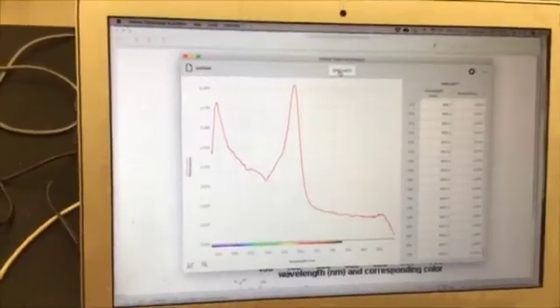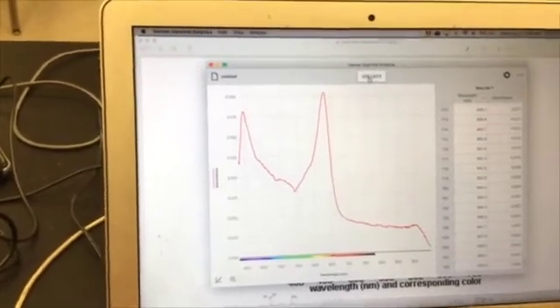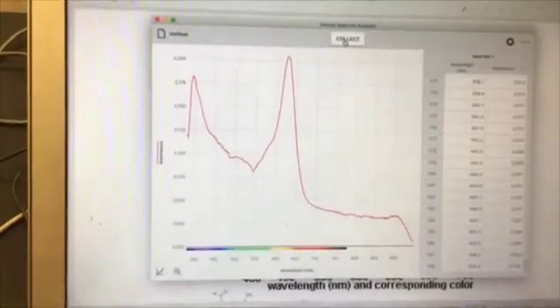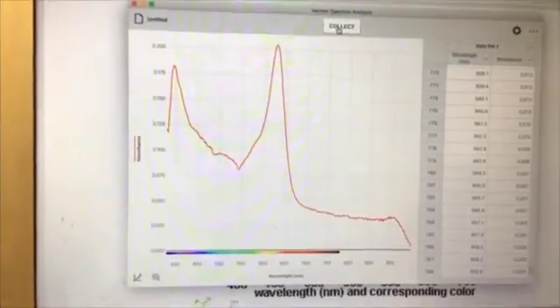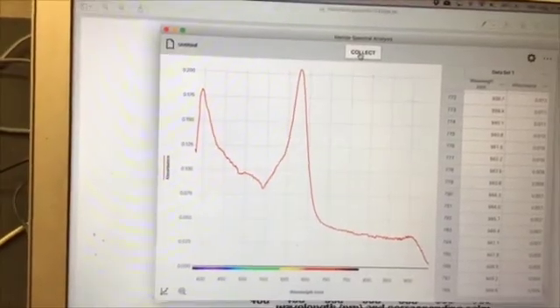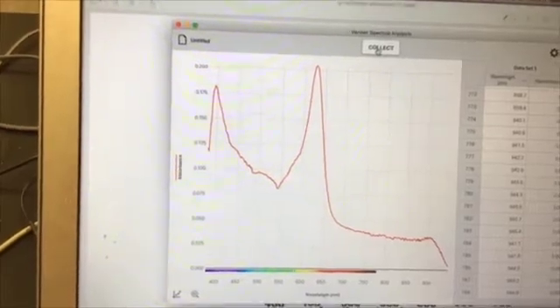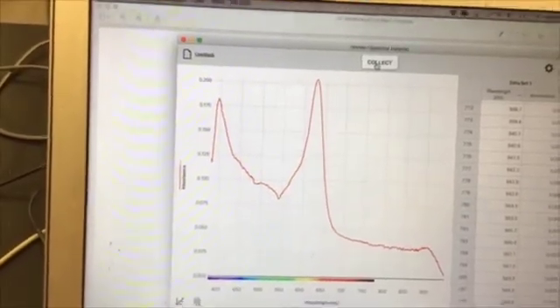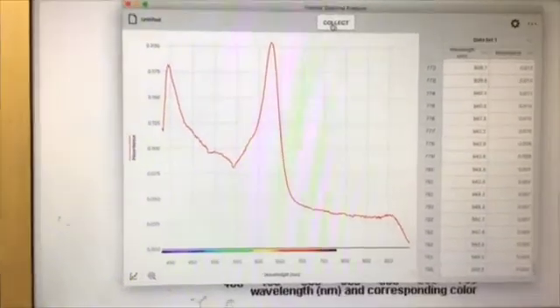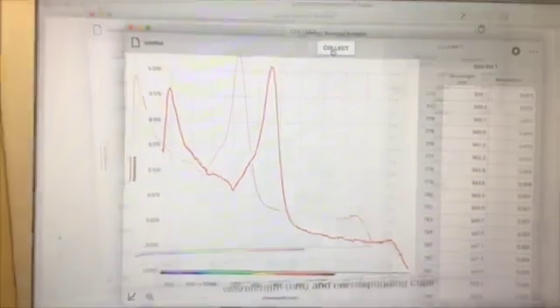And like I said, it scaled it up to a proper amount there on the screen. So that there is the absorption for our Gatorade. So if we had our choice of any wavelength at all, which wavelength would we need to choose in order to make this work? Go ahead and pause your screen there and see if you can figure that out. Which wavelength is going to be best for determining this?